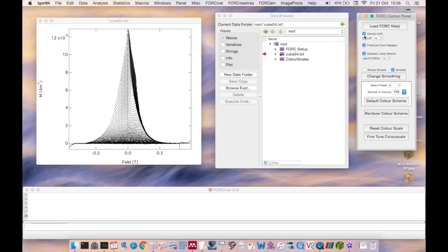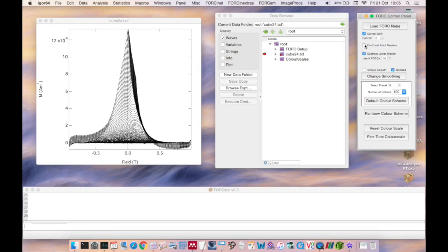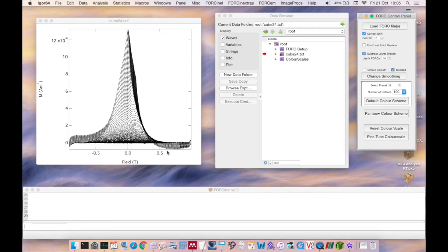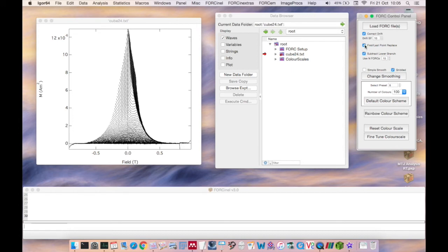So I recommend that drift correction and lower branch subtraction are performed routinely on every fork diagram. Whether or not to remove the first and last point depends very much on the individual measurement. In this case subtracting the lower branch has really highlighted the presence of a strong first and last point artifact in this dataset. So for this reason I would also recommend removing these points using the first last point replace checkbox.